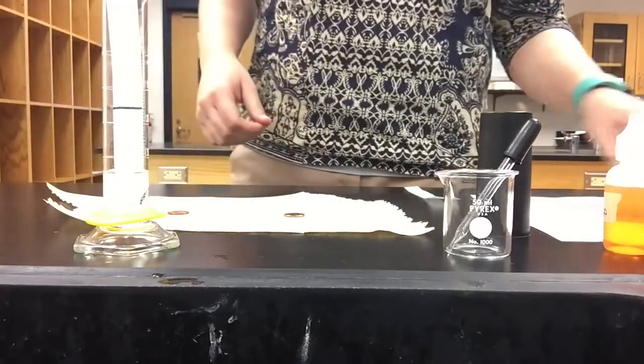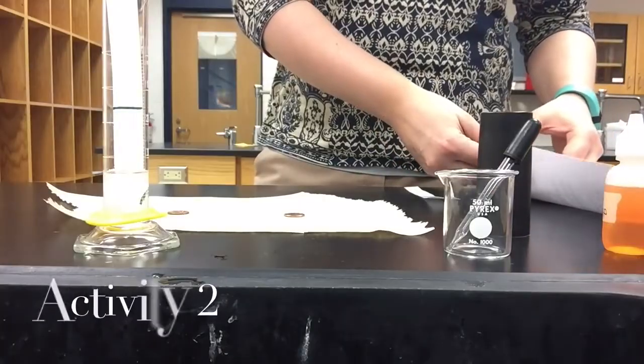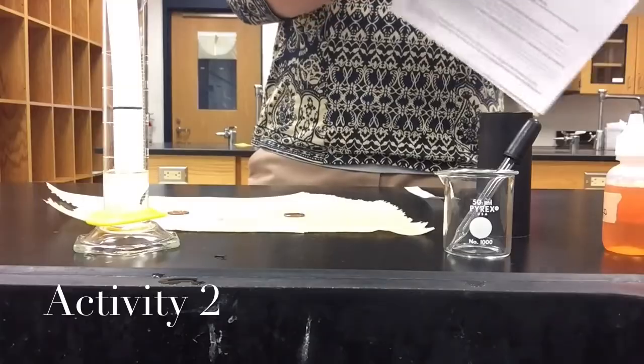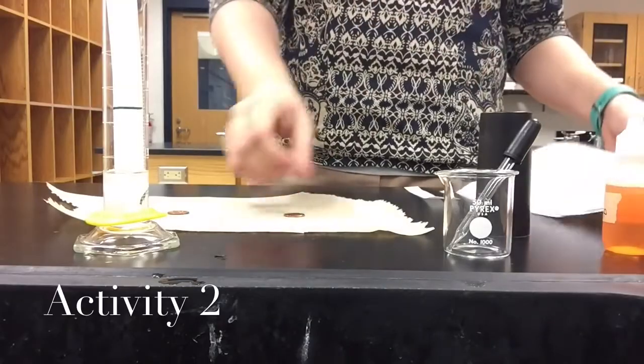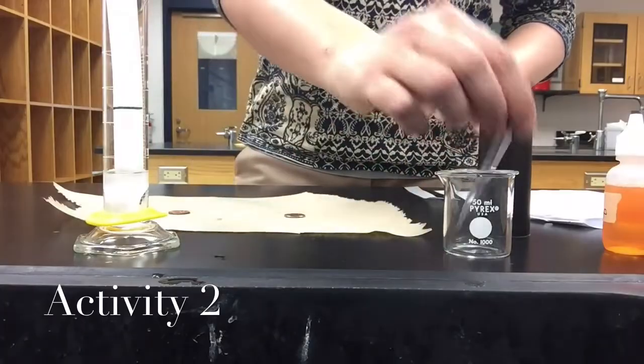We're going to set that aside - you have two questions to answer about that, so make sure you watch and observe. Next, we are going to be using one tap water penny.